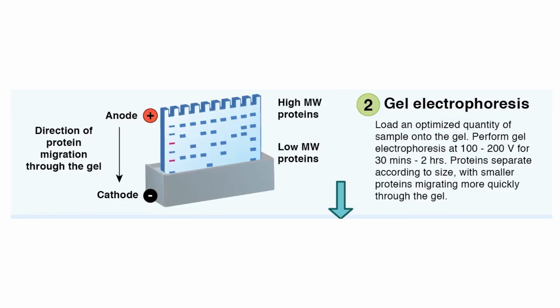The next step is, after you have your protein sample prepared, you run it through gel electrophoresis. When you work at a job later, or when you do your PhD, your lab usually has an established protocol for this. So how much sample should you put in, how much voltage, usually 100 to 200 volts, and how long you should run it. But in general, what electrophoresis does is it separates your proteins into bands, like dark lines.